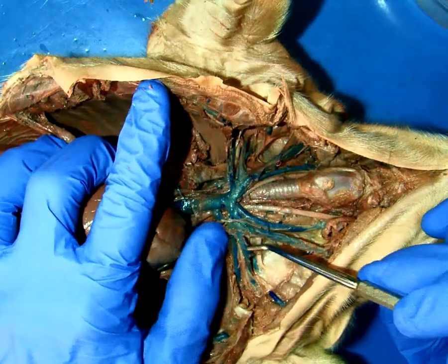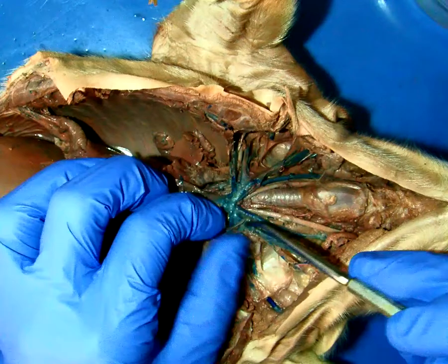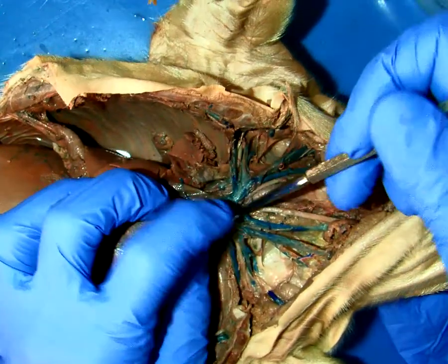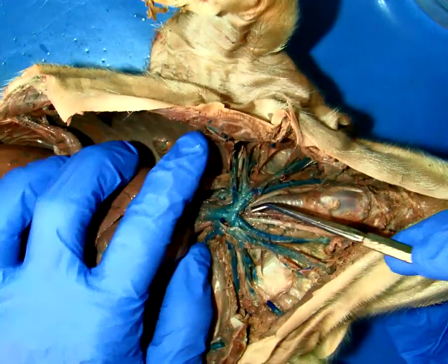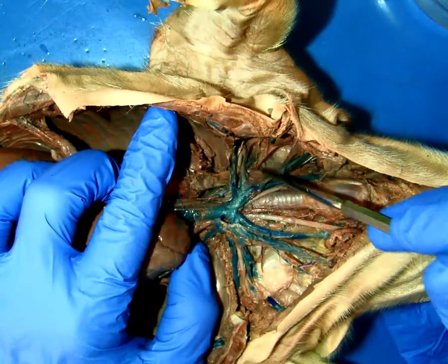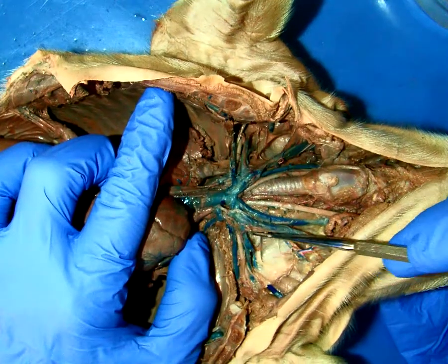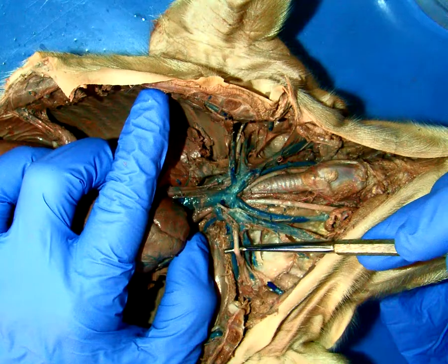Again, you have a lower branch as well, but I don't think that's it. I think it's this upper one. But since we want you to know nothing but the subclavians, if we put a pin in either one of them, you're going to say subclavian, because we're not asking for any other vessel. But that appears to be the right subclavian, and the left subclavian, again, running with the left subclavian artery.